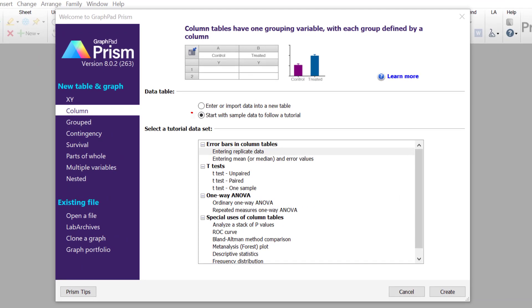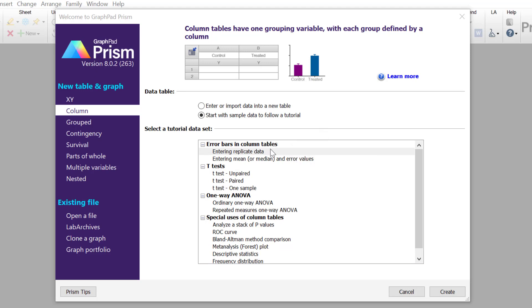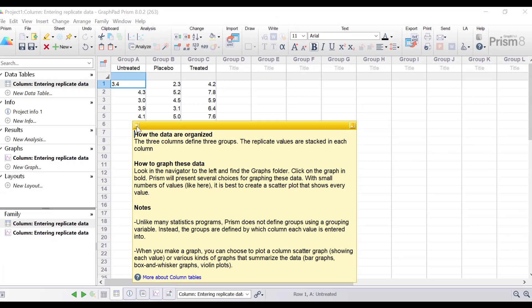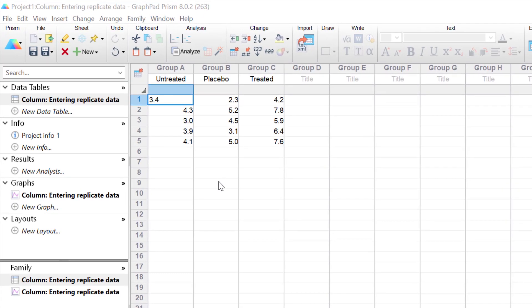Within Prism I'm going to select a column type of table and enter some sample data which is already inside Prism itself, so you can follow along if you wish. I'm going to select entering replicate data, where data is stacked onto each other, and click the Create button. We have three columns or three groups of data in this table: untreated, placebo, and treated. These are replicate values stacked into columns, so each column represents different readings from that same group.